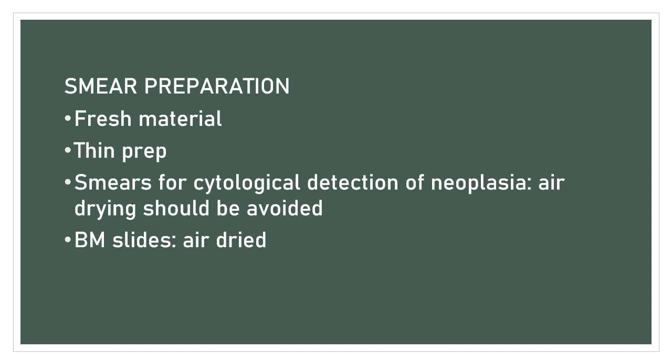Even if you stain it, the pencil will not absorb stain, and the label will not wash off. Okay, and that is for your preparation.